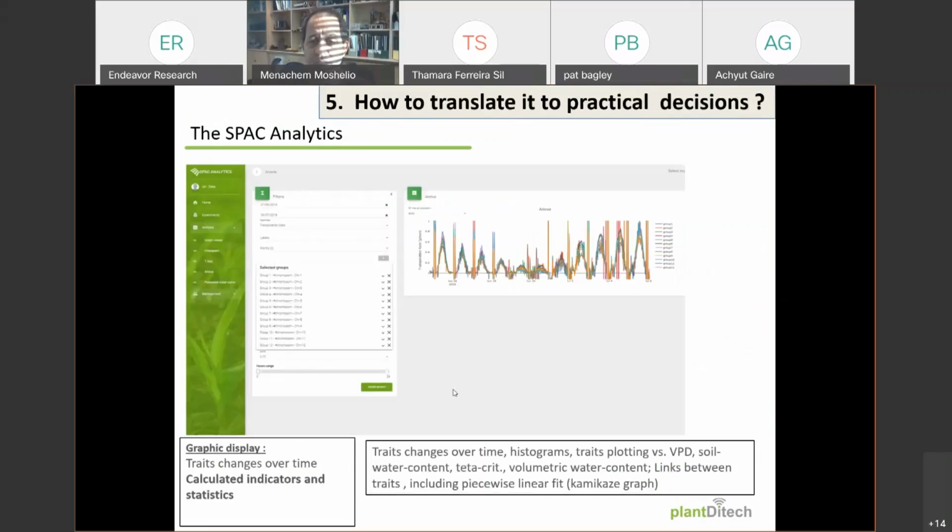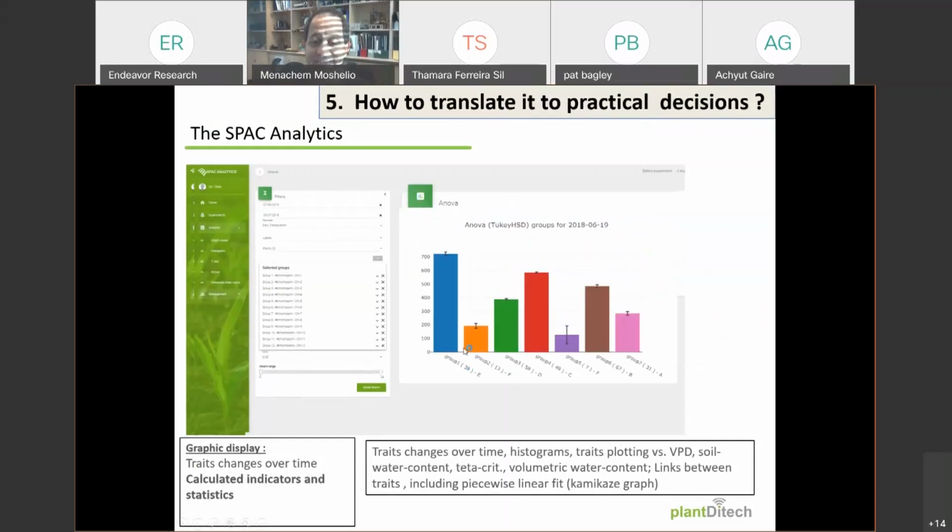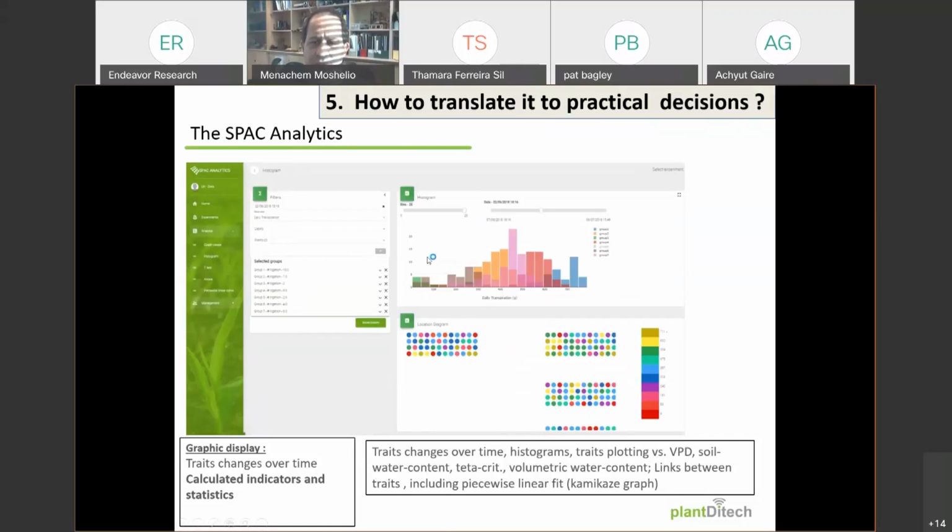The system also enables us to do real statistics online, so we can look at the raw data, we can have averages, we can click on a button and we get a t-test or ANOVA Tukey test on all the treatments, so we also get the significance, and everything is online. This helps us save a lot of time, and more important, translate the data to knowledge. As I told you before, you get a lot of data from this system, so if you have a tool that enables you to get the data online in real time, you can really save a lot of time by regulating or controlling your experiment. So there are many functions, I'm not going to get into it, also histograms, a heat map of each plant in the array, and so on.